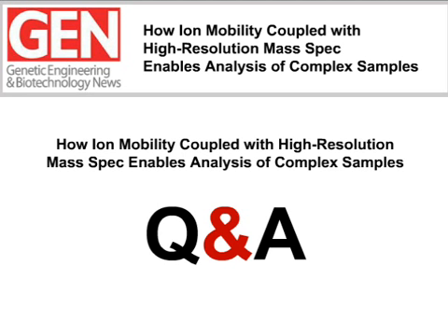Aaron, is there a method published, application note, about isobaric separation? There's actually quite a few nice method papers on the IMS separation. One of my favorites is by Thomas Wittenbaugh, in Topics in Current Chemistry in 2003, volume 225, pages 207 through 232, and that's a great one. There are also quite a few others, but that one's a really nice review article on the IMS isobaric separation. Perfect. Thanks for that information.